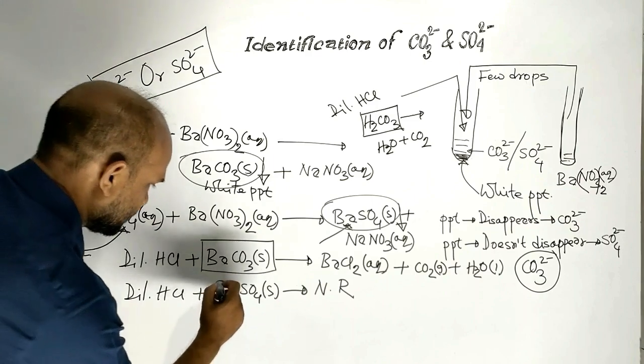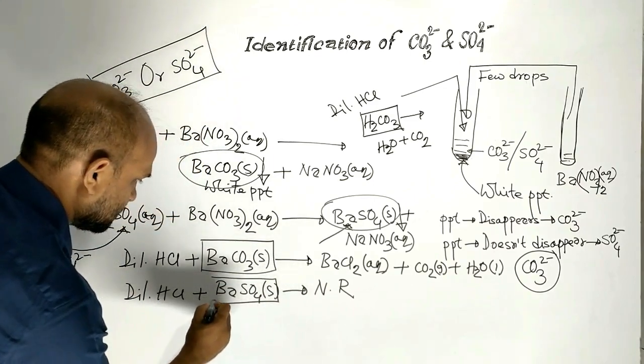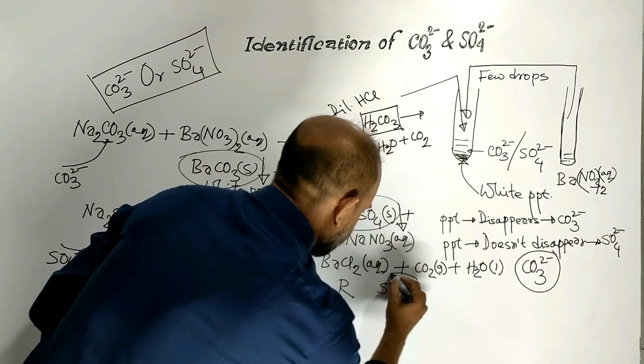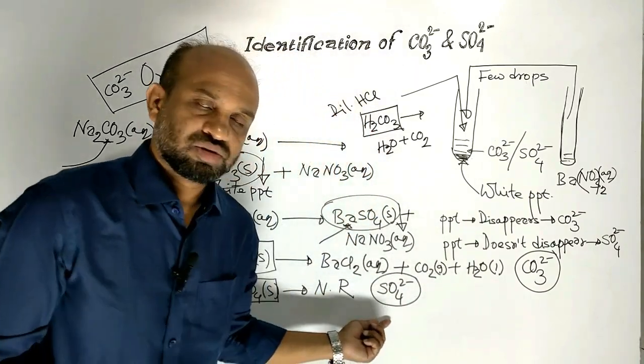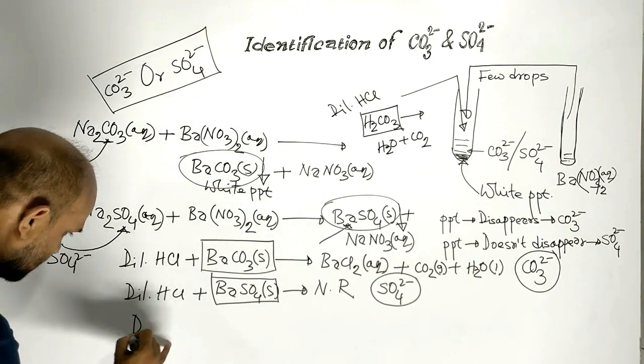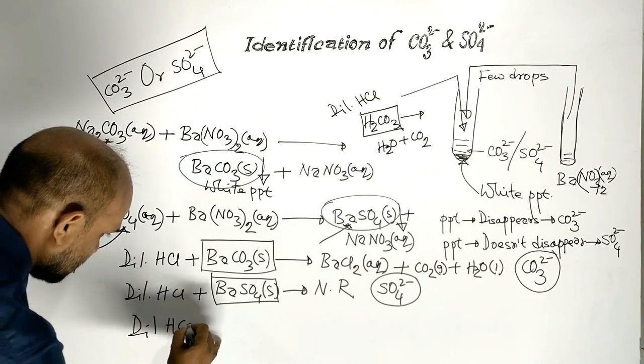This confirms the presence of sulfate ion in the solution. Let us consider this reaction happens here.